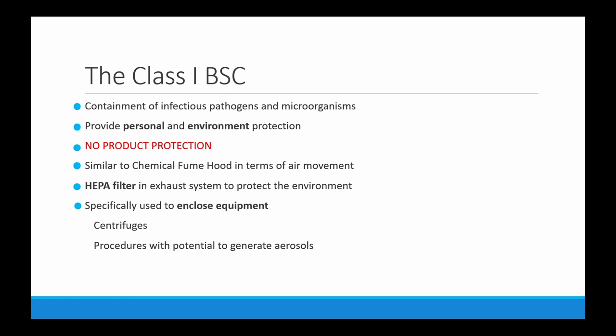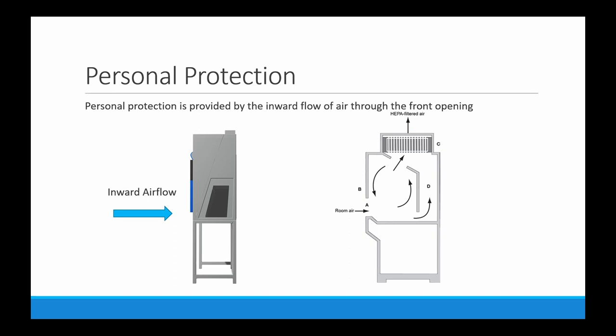Class one biosafety cabinets are similar to a chemical fume hood in terms of air movement. HEPA filters, which stand for High Efficiency Particulate Air filters, are embedded in the exhaust system for contaminated air purification. Class one biosafety cabinets are specifically used for enclosed equipment such as centrifuges and procedures that have the potential to generate aerosols.